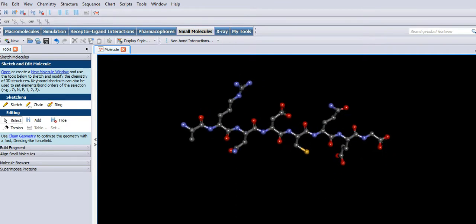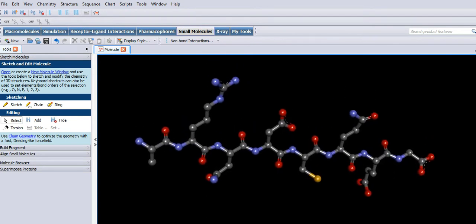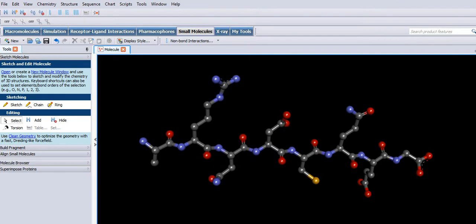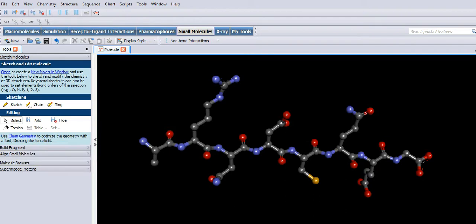This is where clean geometry becomes important. Selecting that now. So that's applied the lowest energy configuration to the molecule.